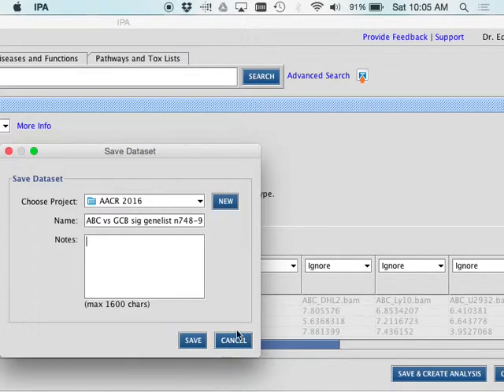Can you hold on one second? It's not showing B17. What's up? For whatever reason, the gene list here still says 0, but everything else looks right. Okay, this is the wrong ID. You want the Ensembl ID here. Okay, now how are we doing? 713. Yeah, you're good. Is this under core analysis? Core analysis. Yeah. Okay, now this is where we are. And then you said to save and create. So hit Save and Create.